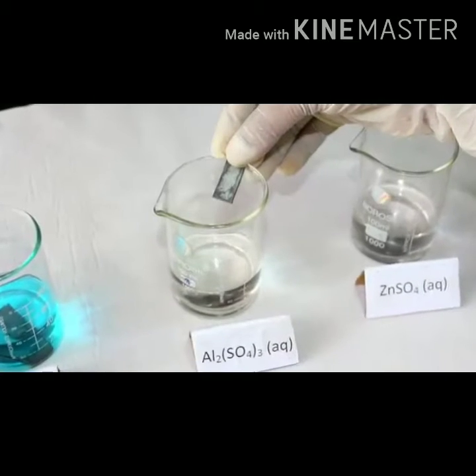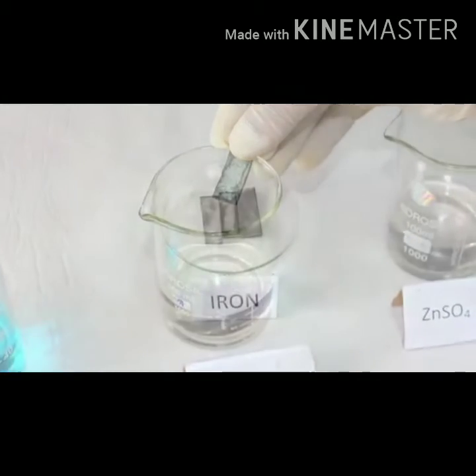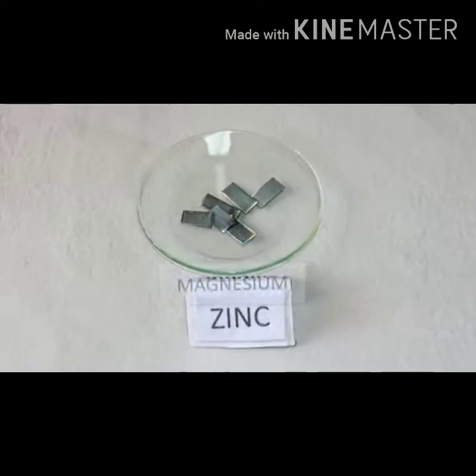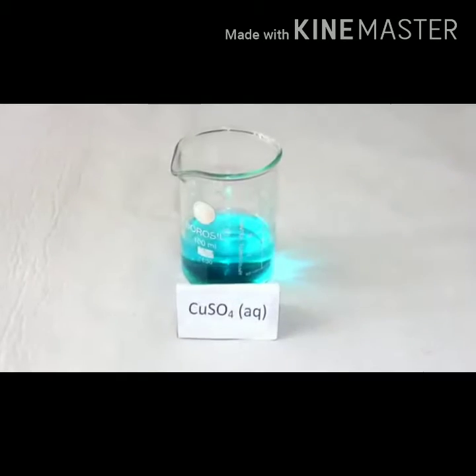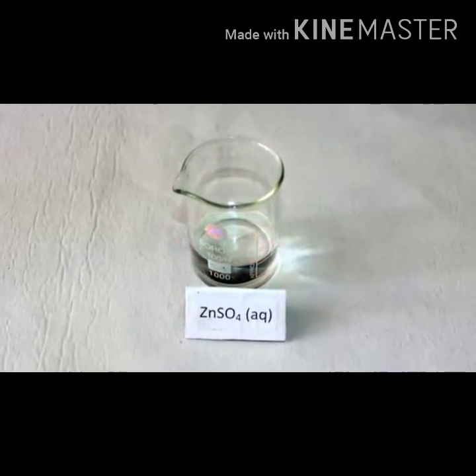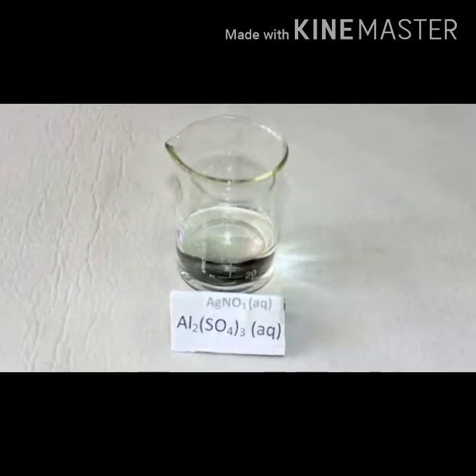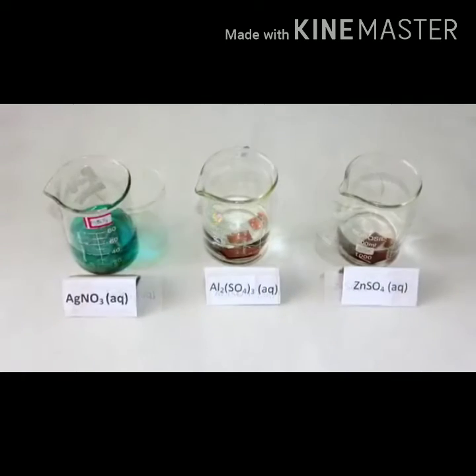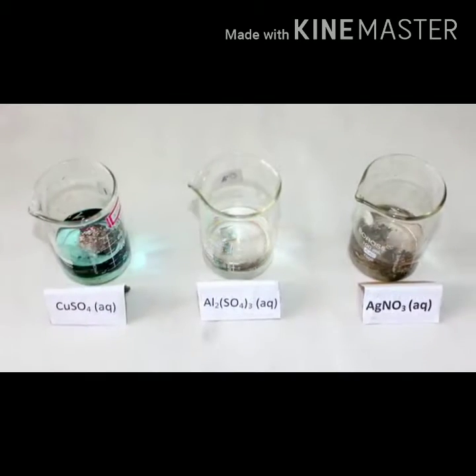In this experiment, our aim is to observe the action of iron, copper, zinc and magnesium on the solutions of copper sulfate, zinc sulfate, aluminium sulfate and silver nitrate and arrange them in the order of reactivity based on the results observed.